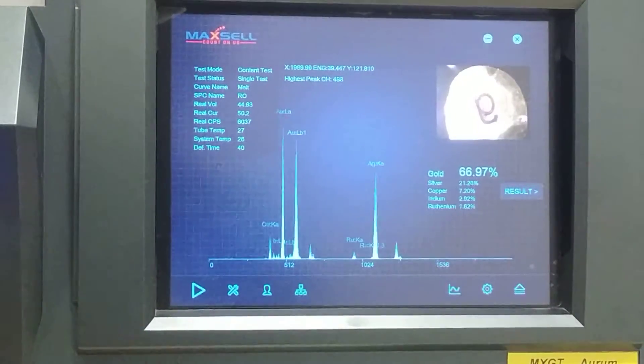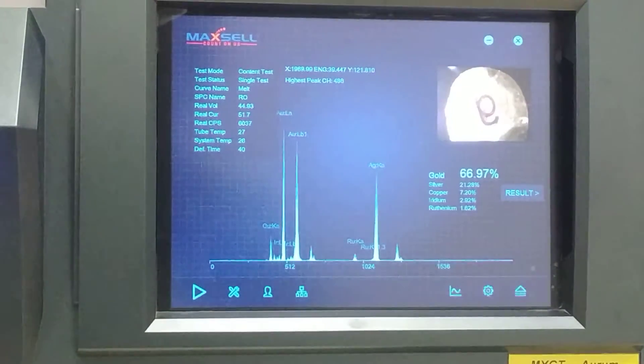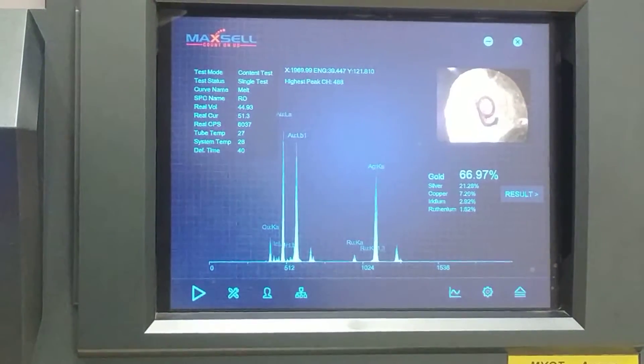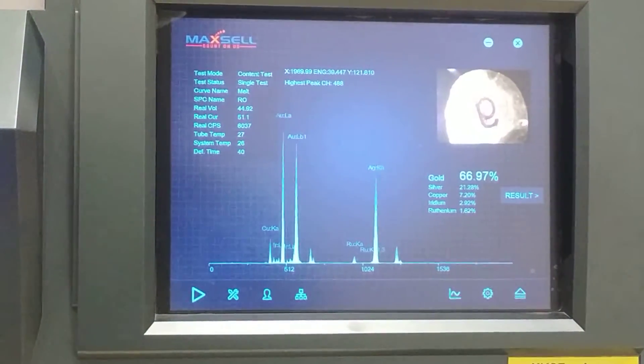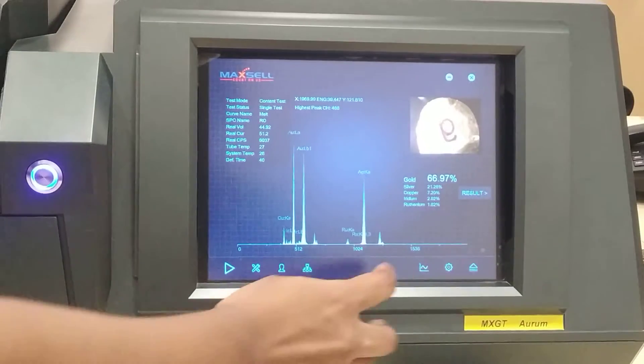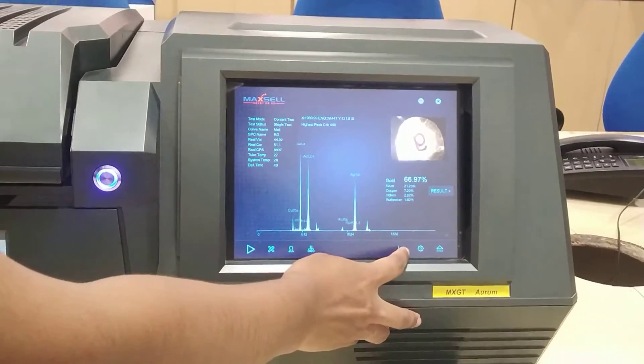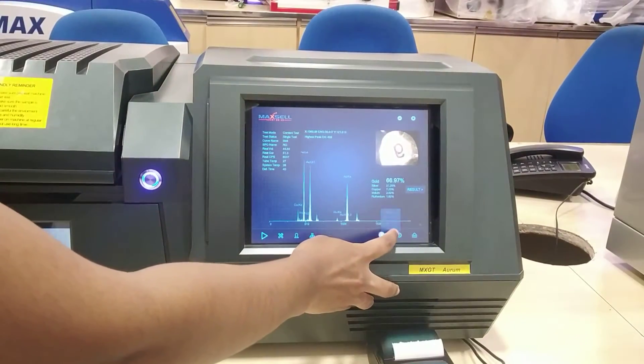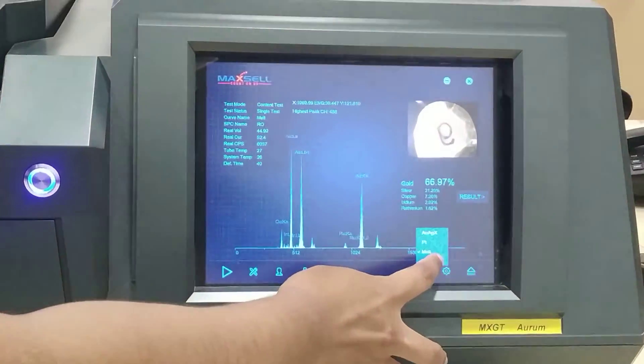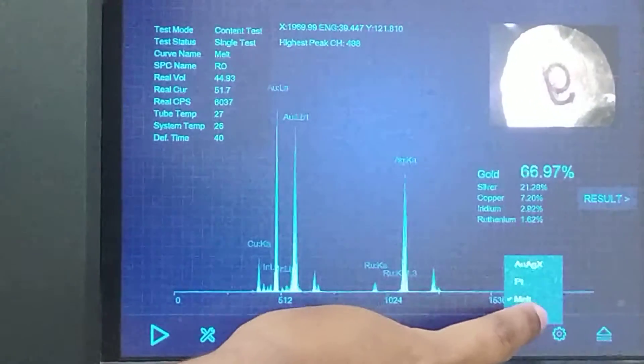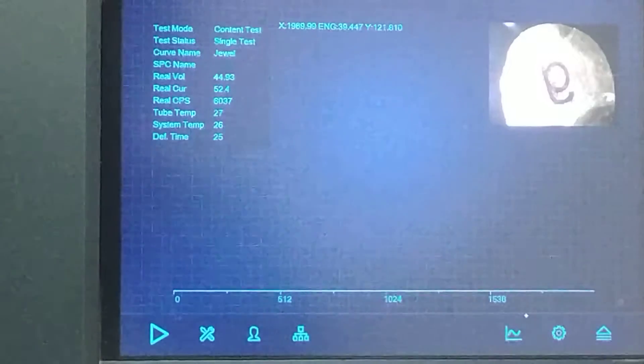Now the test has ended. You can see iridium is 2.92% and gold is 66.97%. Now we are going to check a piece of jewellery — we have to change the curve to 'jewel'.